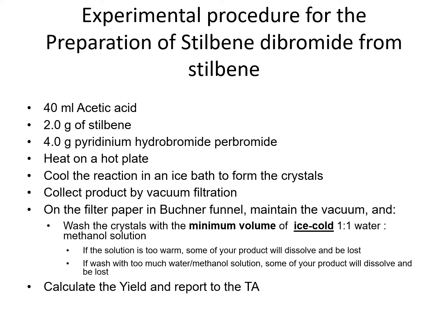You can put the solution with the crystals on a Buchner funnel, attach the Buchner funnel to the mouth of a suction Erlenmeyer flask, and then you can do the filtration.